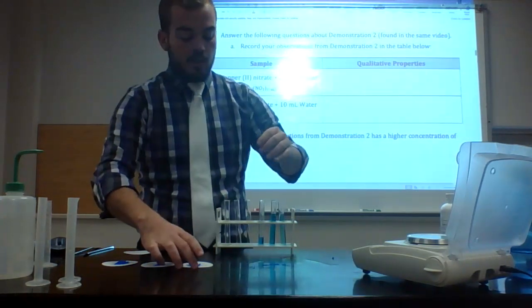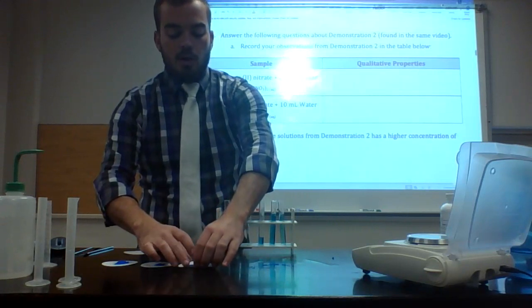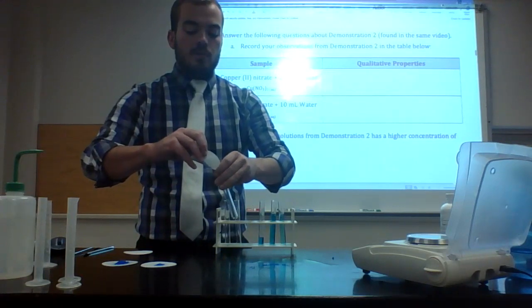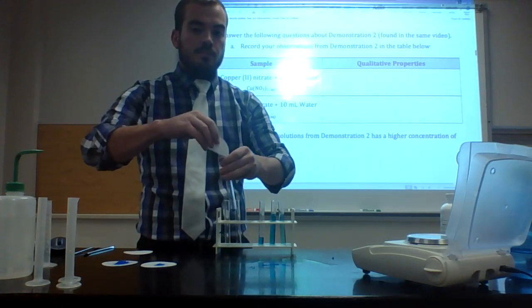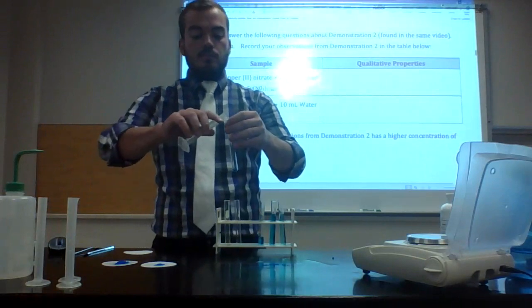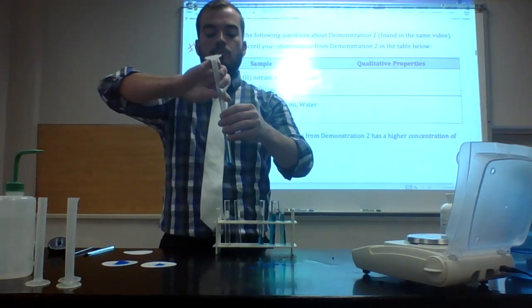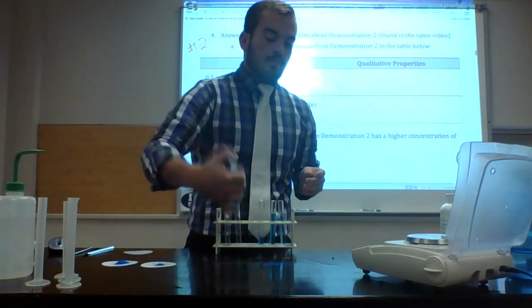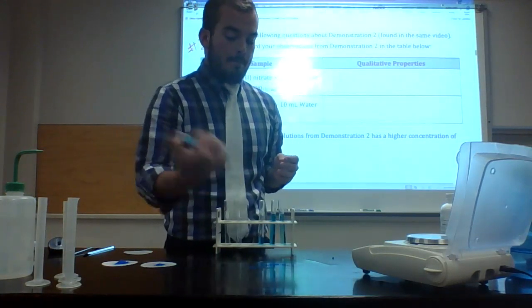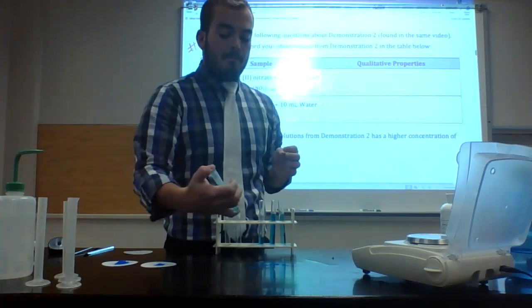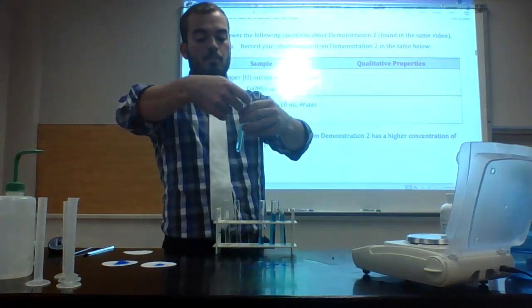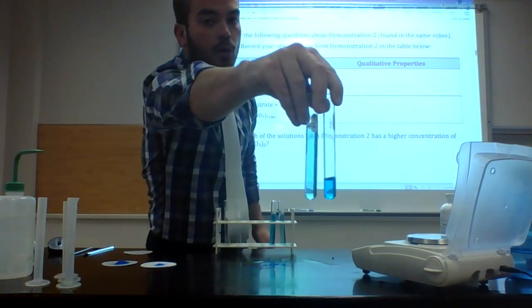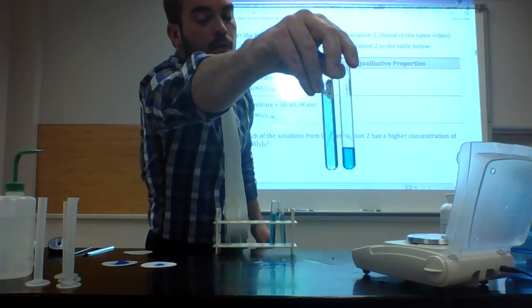I'll take the next one, also 0.5 grams of copper(II) nitrate, but we're going to do 10 milliliters of water this time.